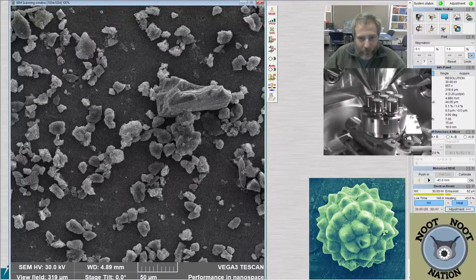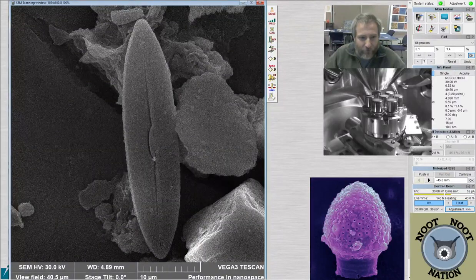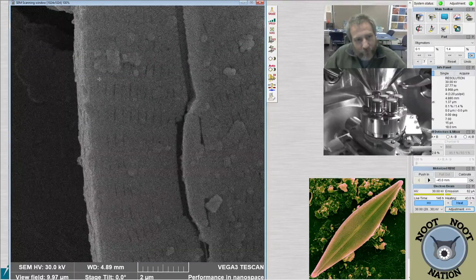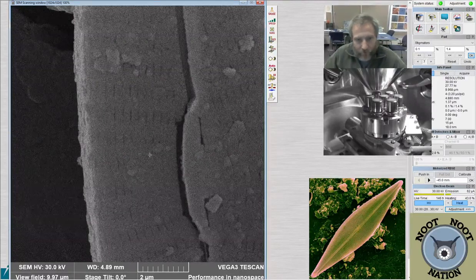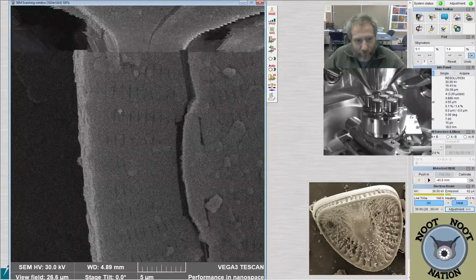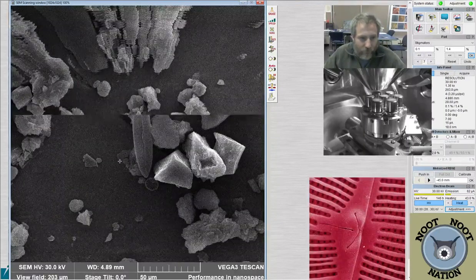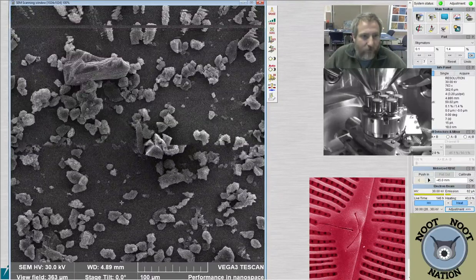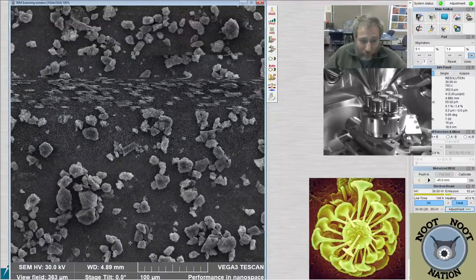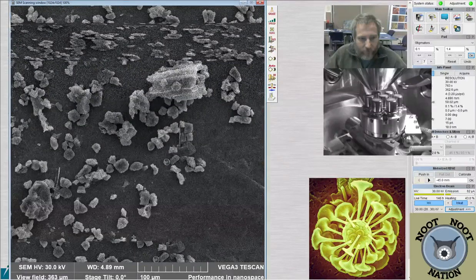I think I saw a diatom right here. Oh, it's got a huge chunk broken in the middle, connecting the two raphe branches. That is a Navicula. You can tell because the areolae are slit-shaped, or what we call lineolate. And it's got a big chunk broken here. This is the raphe, and there's a fracture on the valve face that's basically connecting the two branches of the raphe that normally would only be internally connected by a little tube. So it's undergone some sort of stress and broken, probably while it was being transported downstream, I mean, to the site.